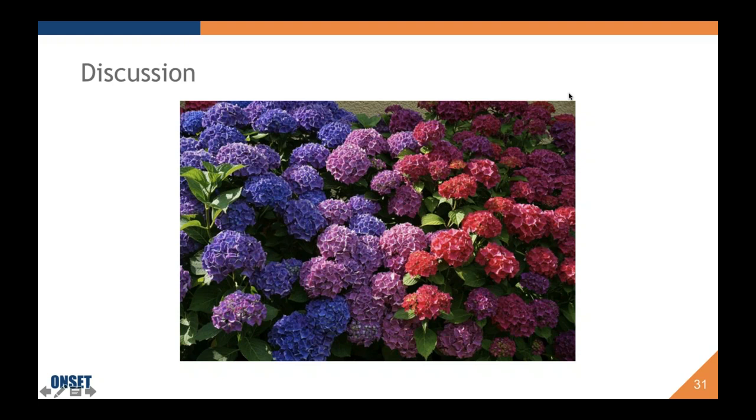And then the next question about temperature, 55 to 60 degrees Celsius, is outside of the range of the logger. The range that we provide has two purposes. One, it is the range within which we can comfortably state our accuracy statement and resolution. However, outside of that range, I'm not sure how that will affect your accuracy. If you don't need it to be as good as 0.1, then that's something you'd have to decide on your own.